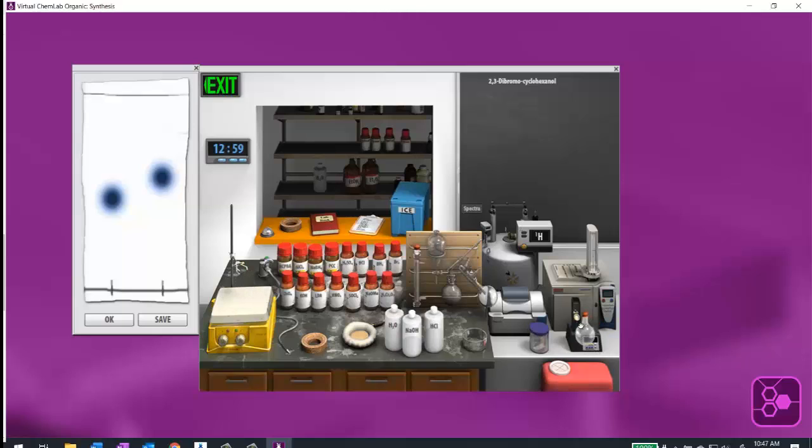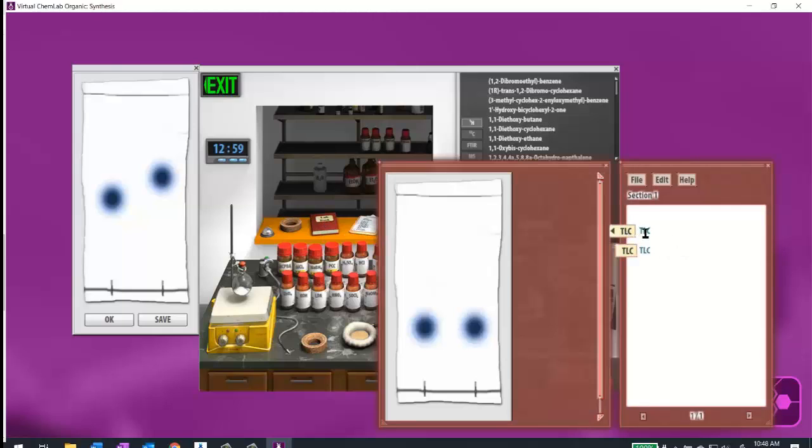And then we can do different methods to get our data. So I can do IR, I can do melting point, I can do NMR, and so we just click on the buttons to be able to do that. For NMR, you're going to need to grab an NMR tube. For melting point, you're going to need the melting point setup, IR, etc. So you'll see that there are different functionalities in here. Your instructions will give you a little bit more, and then there will be an included document that will have more on how to get started, and you should try to do that.